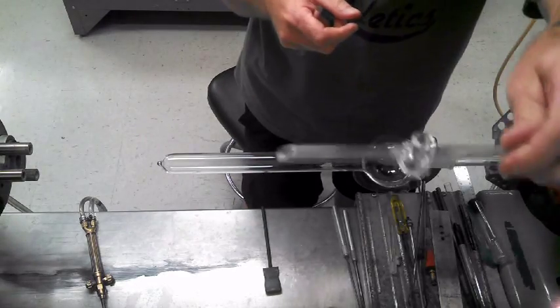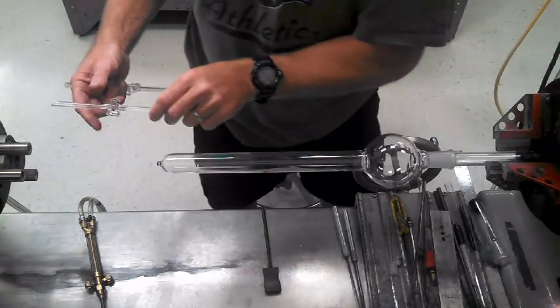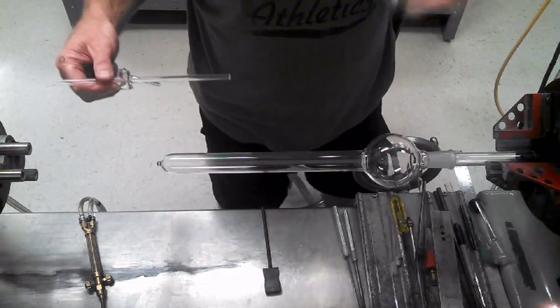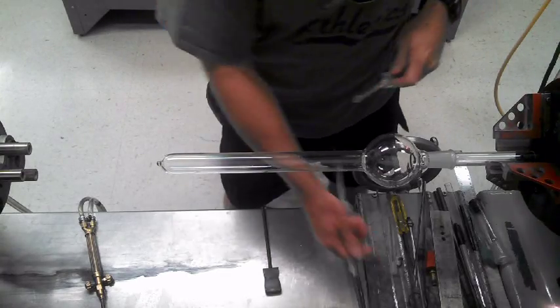What I do is I go to the saw first and cut it to the right length, install it on the glassware, then when I'm done, I fire polish it and throw it in the oven — and I bypass getting the whole piece wet. I'll go ahead and demonstrate it.